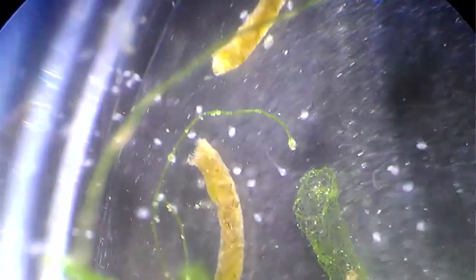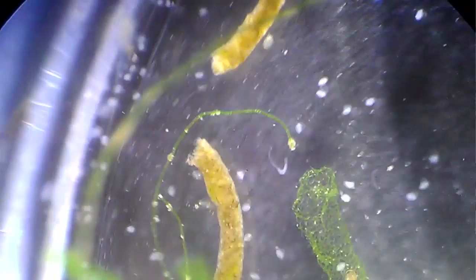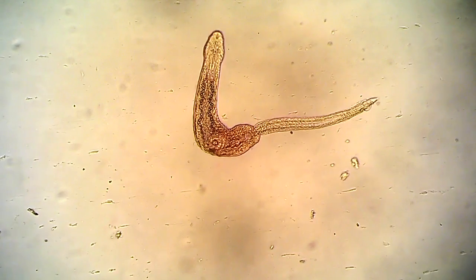What we're looking at is a parasite called Echinostoma trevolvus. It's a scientific name for an intestinal fluke. It's a parasitic worm that infects the intestines of mammals, in this case, muskrats.